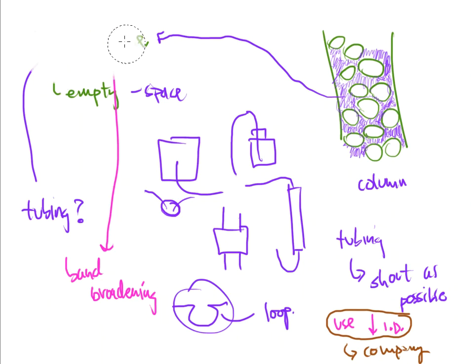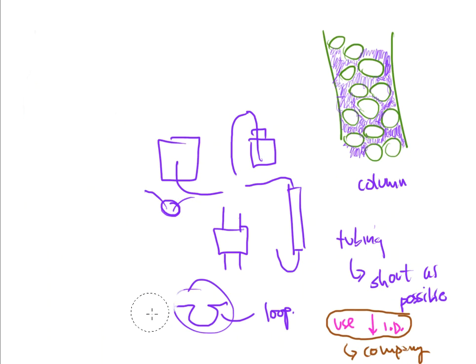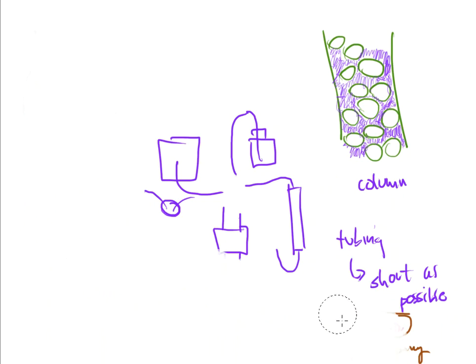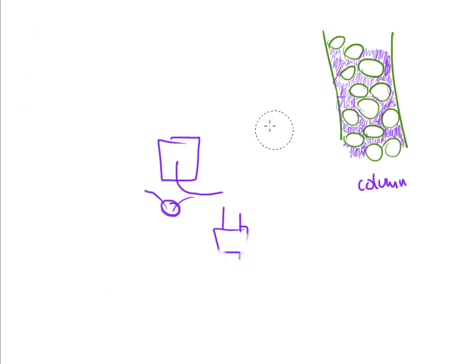Guys, in the last video, we were talking about the column, and we said this column's got particles on the inside, right? And we've always talked about these particles, but we've really only focused on the surface of the particle and not really on the particle itself. So with that said, cations and anions have different columns on the side of the house, and I want to make sure that I'm choosing the proper column for the proper purpose.